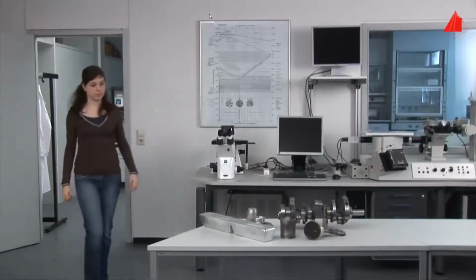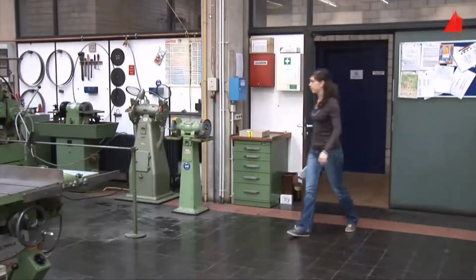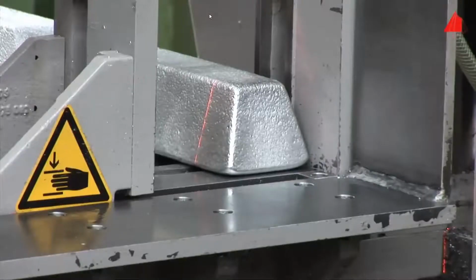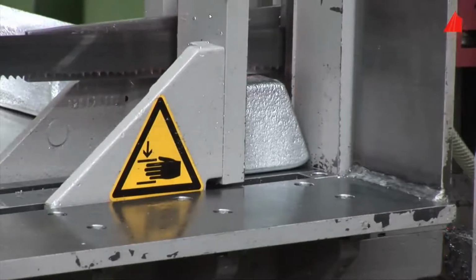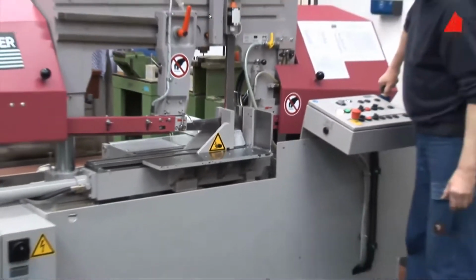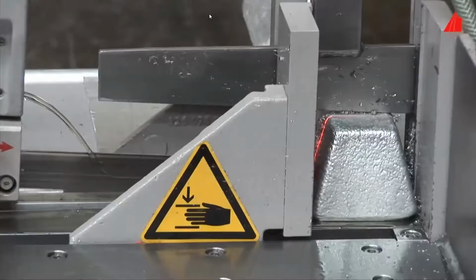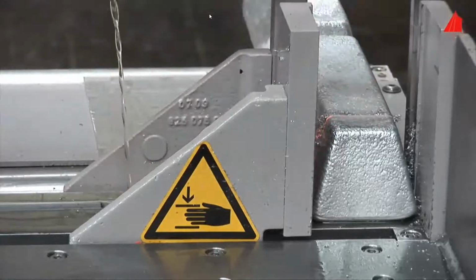To have a look at the inside, the material tester has to start with a raw cut through the ingot. She picks up the ingot and carries it from the laboratory to the mechanical workshop. The bandsaw machine has already been prepared. The ingot is positioned on the saw table so that the red laser marking line indicates the intended cutting plane. Clamping jaws fix the ingot securely. Then the bandsaw gently sets onto the block and cuts it slowly under intensive liquid cooling. It is important to keep the material as cool as possible to avoid changes in the material structure. That's it. The ingot has been sectioned.